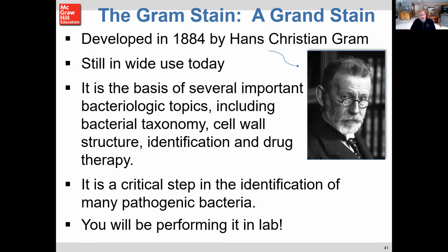And generally, as it mentions here in the fourth bullet, it is a critical step in identification of many pathogenic bacteria. So this is a stain that's performed all the time in diagnostic labs to help us try to figure out what kind of pathogen we might be dealing with. Generally, the gram-negative bacteria tend to be more pathogenic than gram-positive.